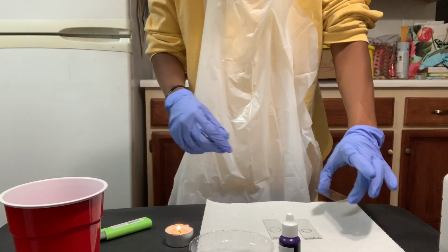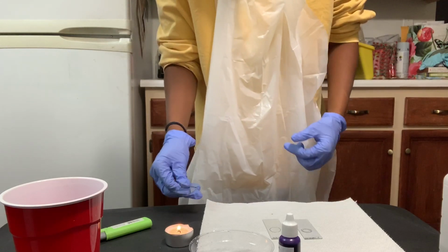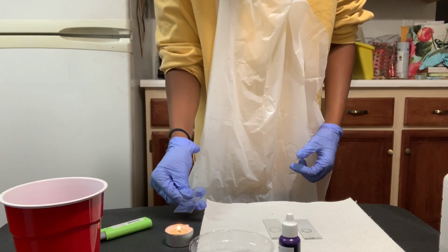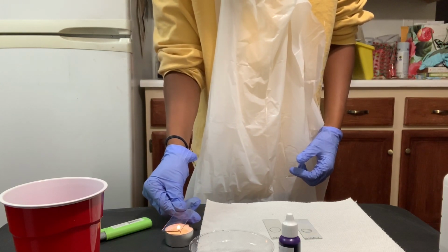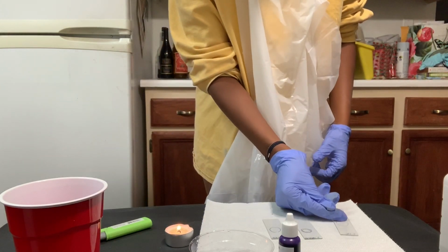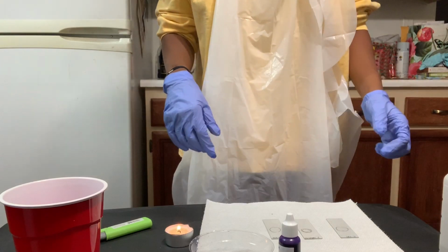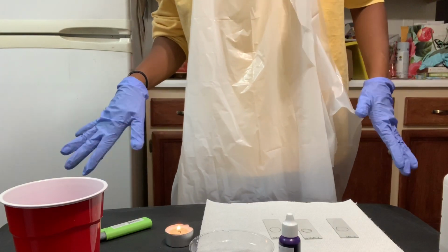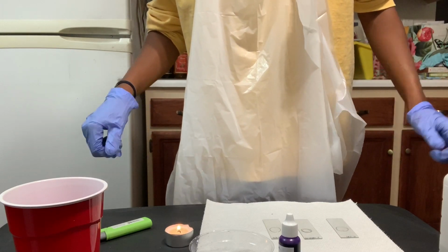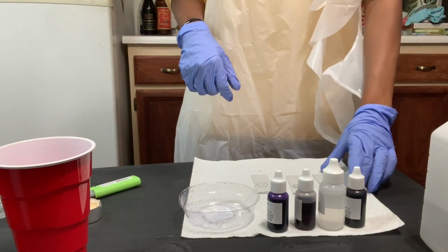Now that my first slide has dried, I am going to heat fix it, and allow that to cool for 10 minutes. I will continue the same procedure for S. epidermidis and S. cerevisiae and then come back. It has been 10 minutes since I heat fixed the E. coli.